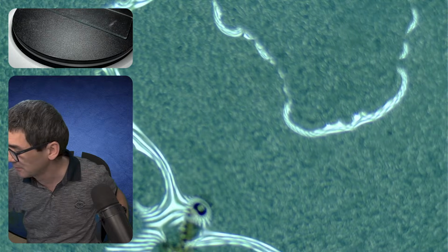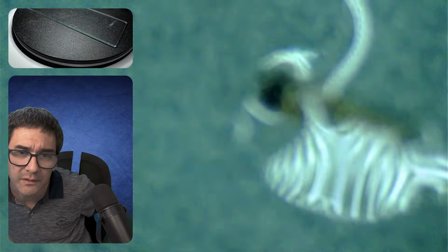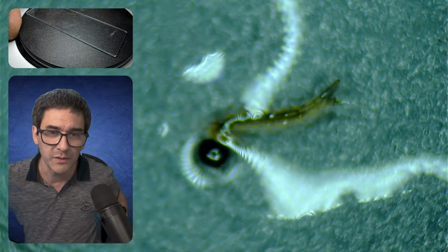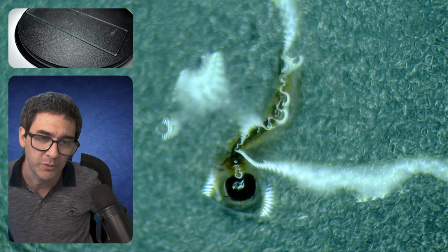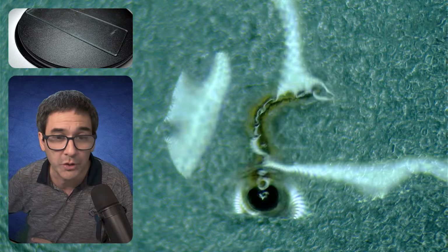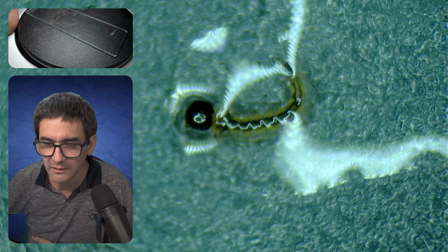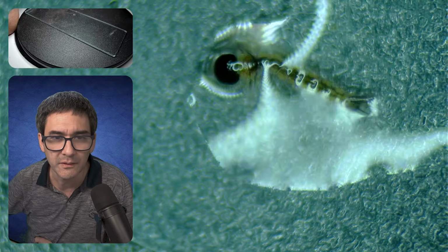I have to take it a little bit. And yep, here it is. One of the most dangerous animals in the world. That would actually have been also quite a nice title of the live stream. Not only algae, but we're also looking at the most dangerous animal in the world, which appears to be what could be the larva of a mosquito, but doesn't. Yeah, or related. Looks like chironomids.